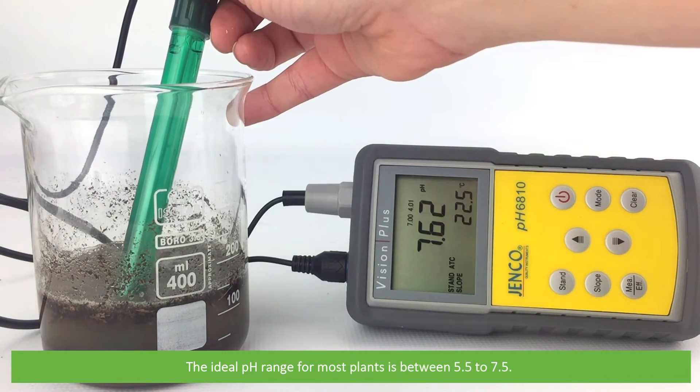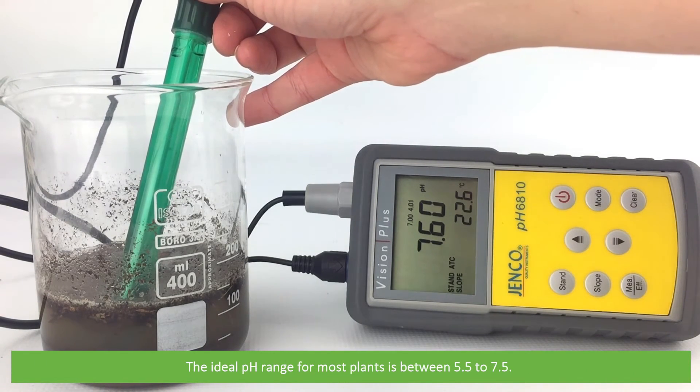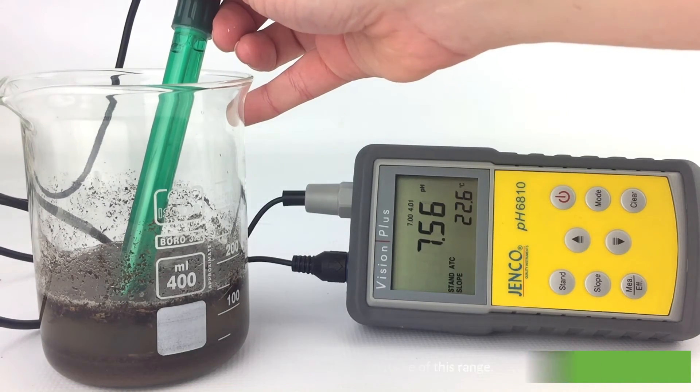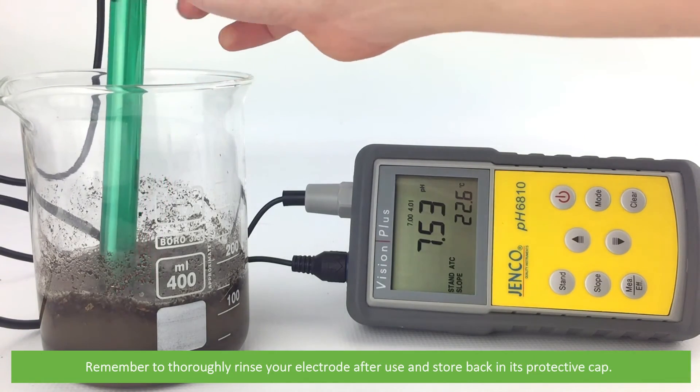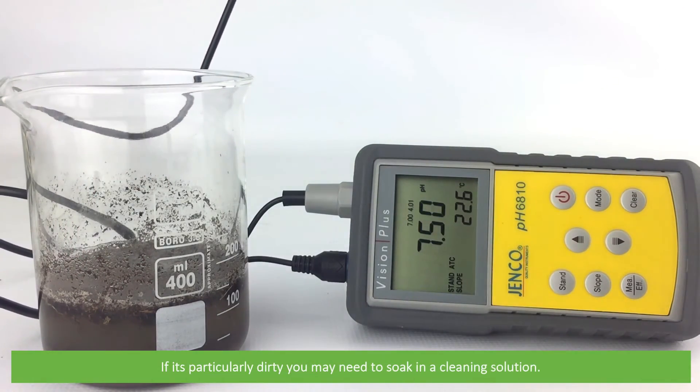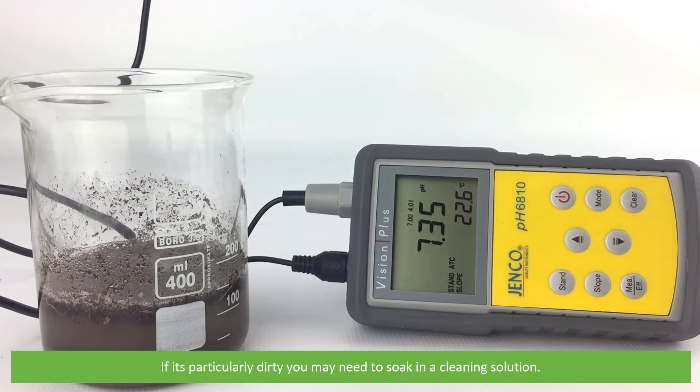For plants, the ideal pH range is between 5.5 to 7.5, although some plants do thrive outside of this range. Remember to thoroughly rinse your electrode after use and store it back in its protective cap. If the electrode is particularly dirty, you might need to soak it in some cleaning solution.